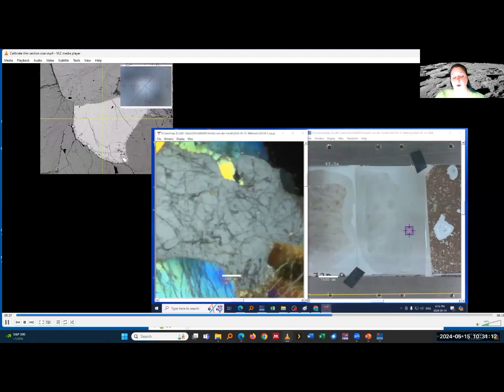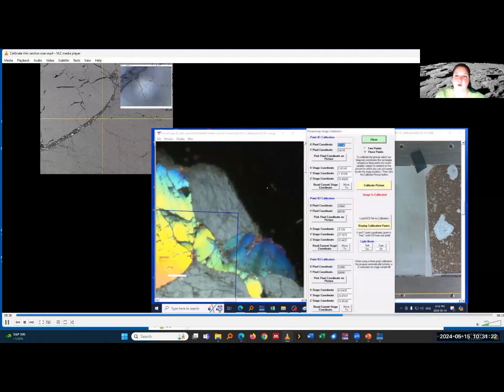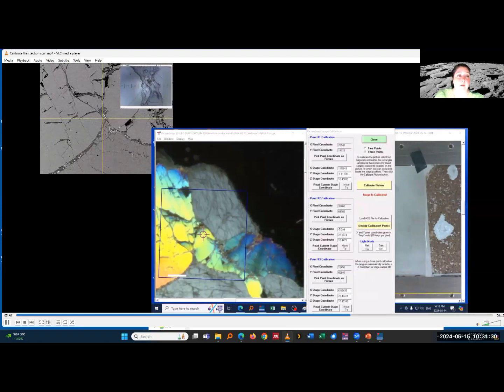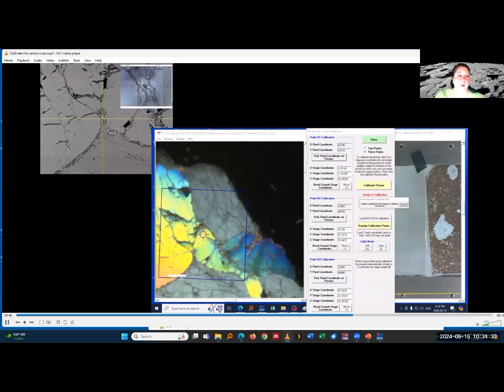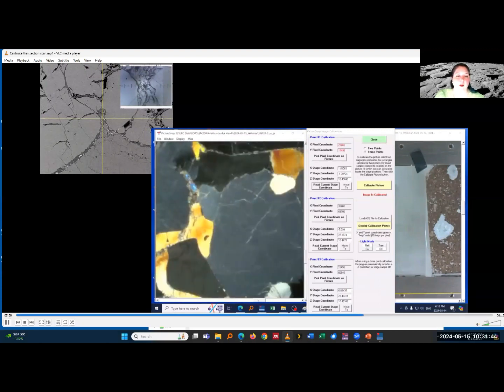If, when you digitize your images, it's very rigid, like if you have something like the Zeiss microscope camera that does it all automatically, then probably the calibration would be immediately perfect. But in this case, where it was done by hand and cropped and whatnot, we might be ever so slightly off. But it's good enough that I can just move to a different area, and I'm within the field of view essentially of where the actual point is.